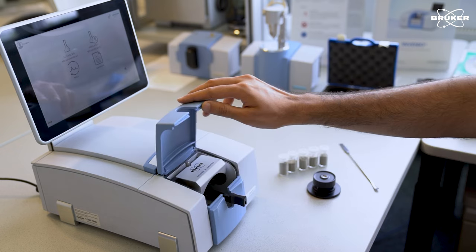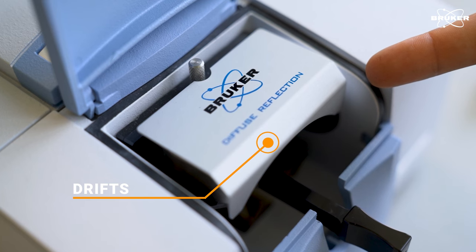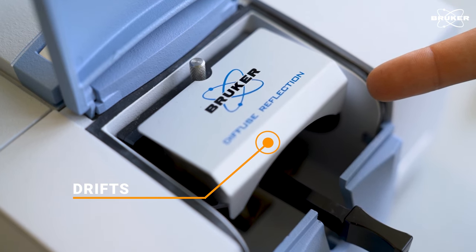DRIFTS stands for Diffuse Reflectance Infrared Fourier Transform Spectroscopy and is perfect to analyze fine powders like cement or soil.